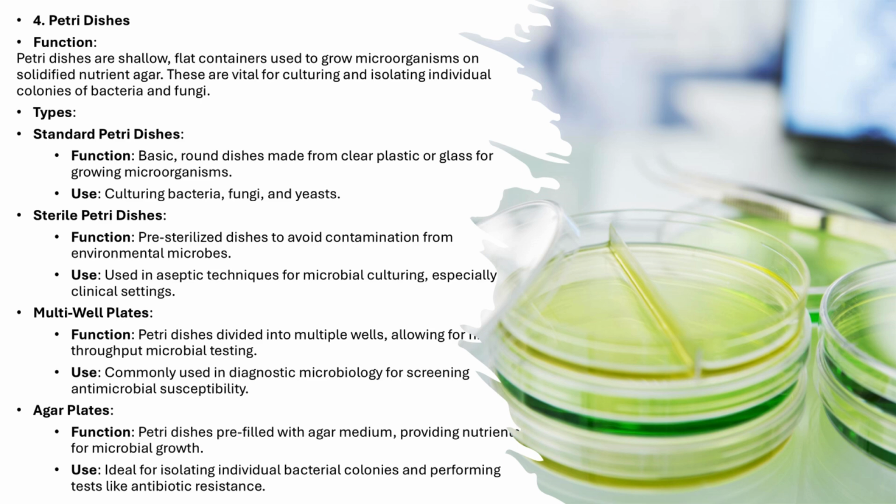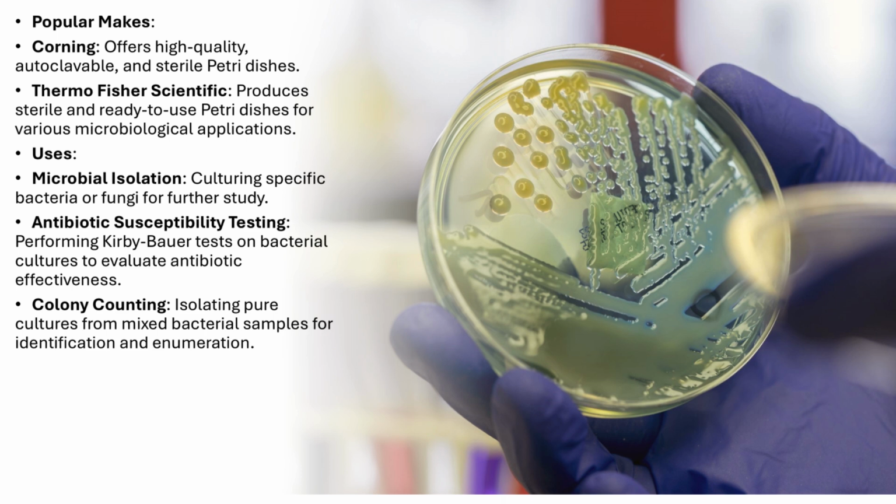Agar plates. Agar plates are Petri dishes that come pre-filled with agar medium, a gel-like substance that provides nutrients for microbial growth. These plates are ideal for isolating individual bacterial colonies and performing tests like antibiotic resistance assays.